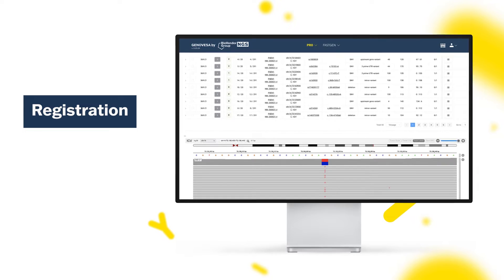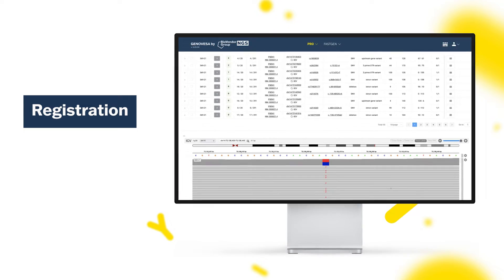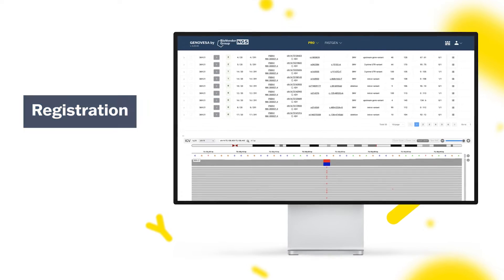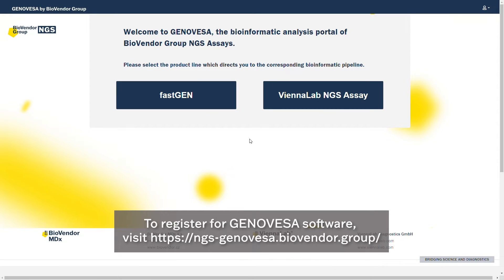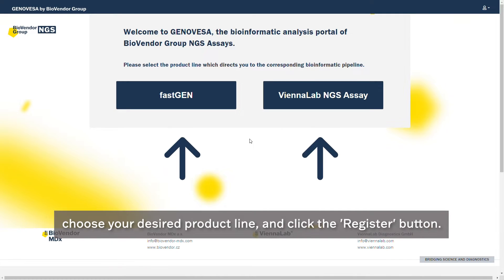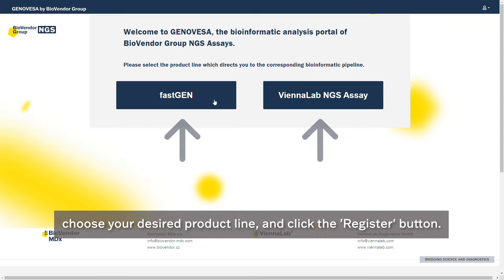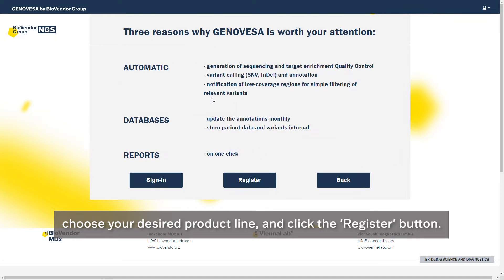Registration. To register for Genovesa software, visit ngs-genovesa.biovendor.group, choose your desired product line, and click the Register button.